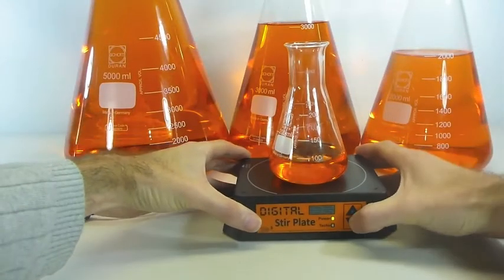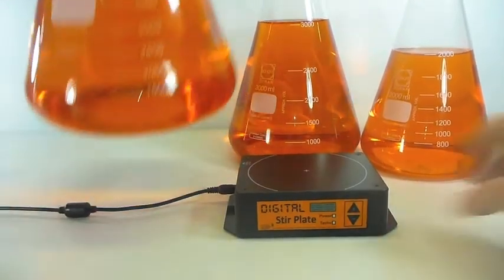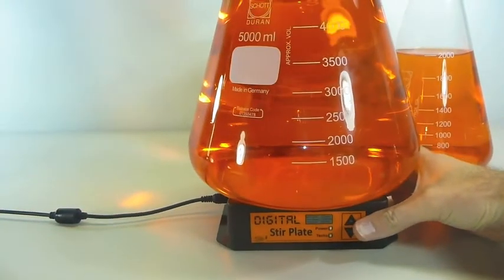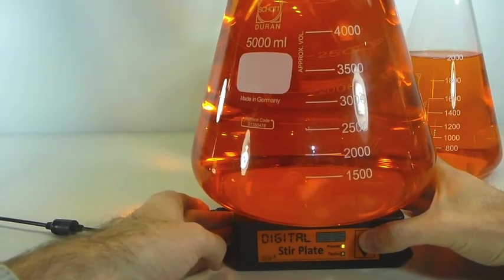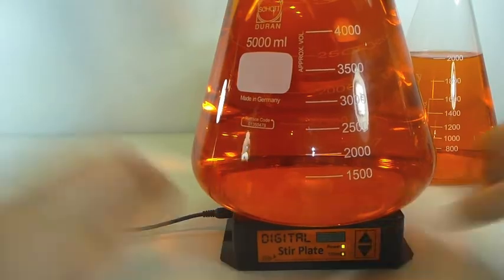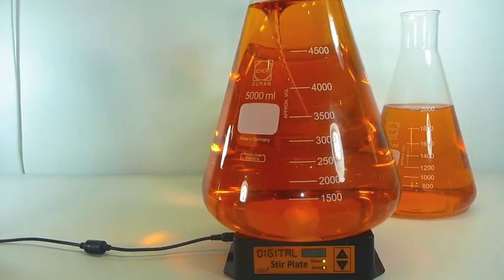Getting to the other end of the scale, the digital stir plate is also able to effectively stir 2 litre, 3 litre, and even 5 litre flasks. Though at 5 litres, the stir plate is positively dwarfed by the flask, it's still able to get a decent vortex going in there, which shows that for such a small package, it's still punching above its weight.